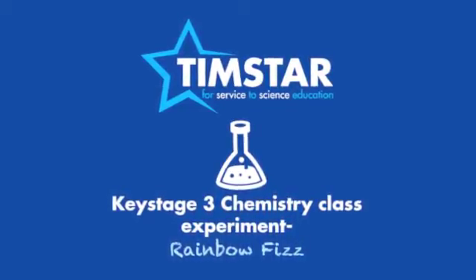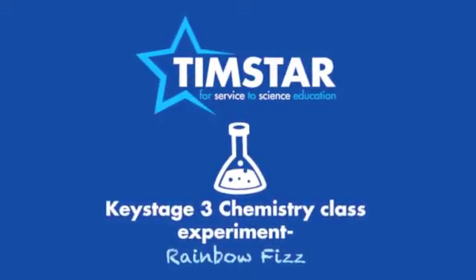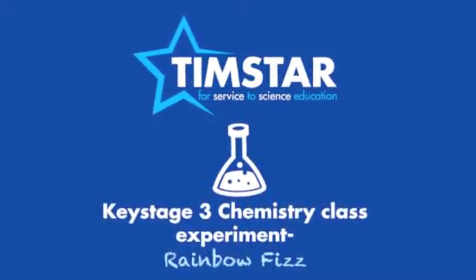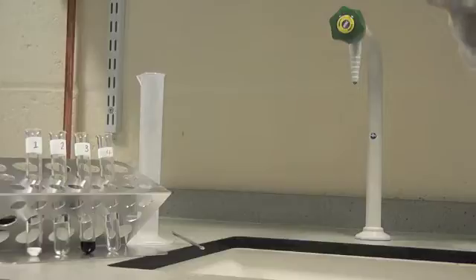Key Stage 3 Chemistry Class Experiment: Rainbow Fizz. Collect four test tubes, test tube rack and a measuring cylinder. Label the test tubes one to four.